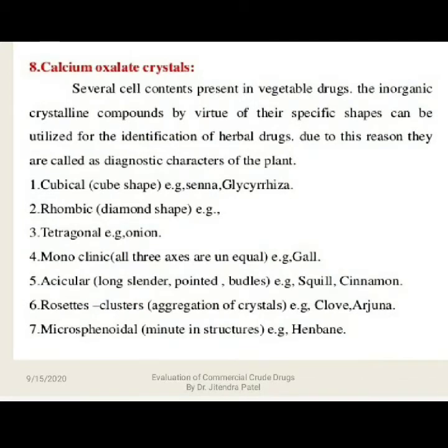In the case of galls, acicular or long, slender, pointed, or bundles, that is in the case of squill and cinnamon. And rosettes, clusters or aggregation of crystals, right? The crystals will be in aggregated form, whatever the calcium oxalate crystal, in the case of clove and arjuna bark. In the microsphenoidal, right?